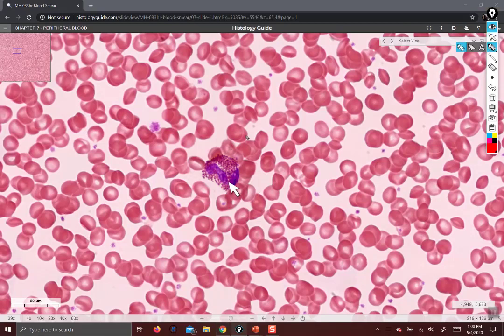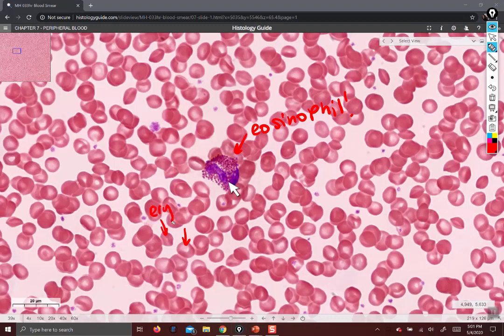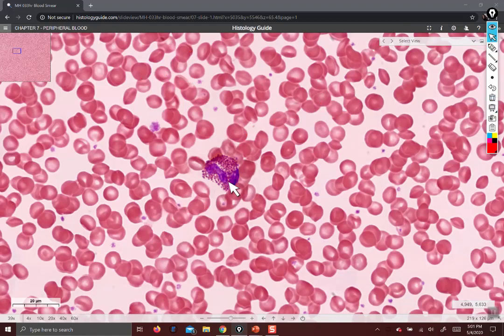Let's label it. And of course these are erythrocytes, and then we've got platelets. That's what you can see in this field of view. Let's go look elsewhere.